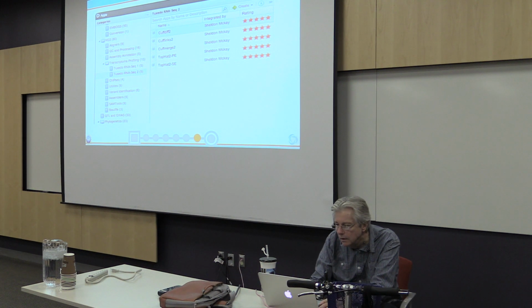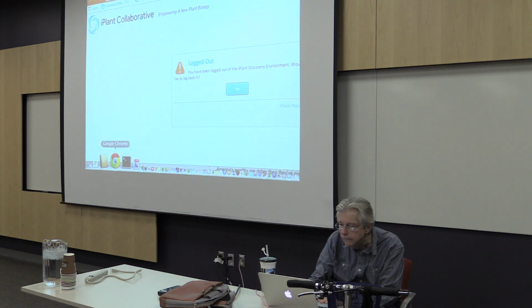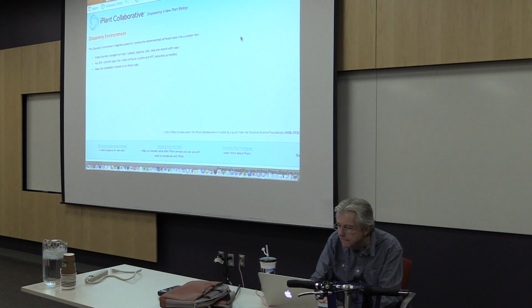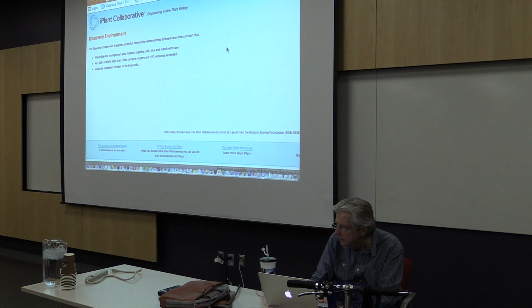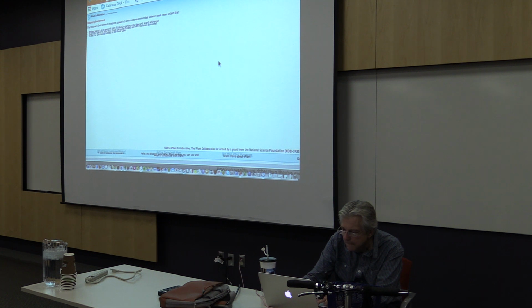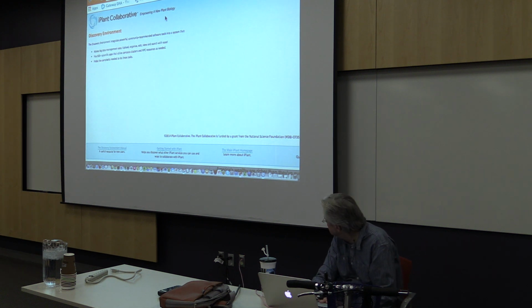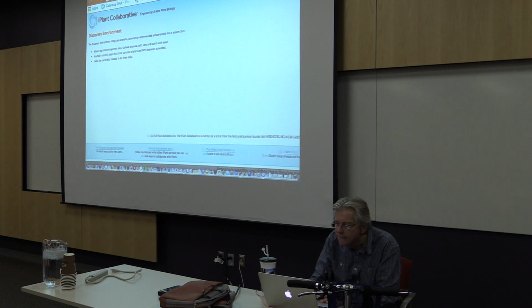So I don't know if you follow how to get into that, but I'm going to switch out to looking at, say I'll log into the discovery environment also. So any problems logging into the discovery environment? Here we go.